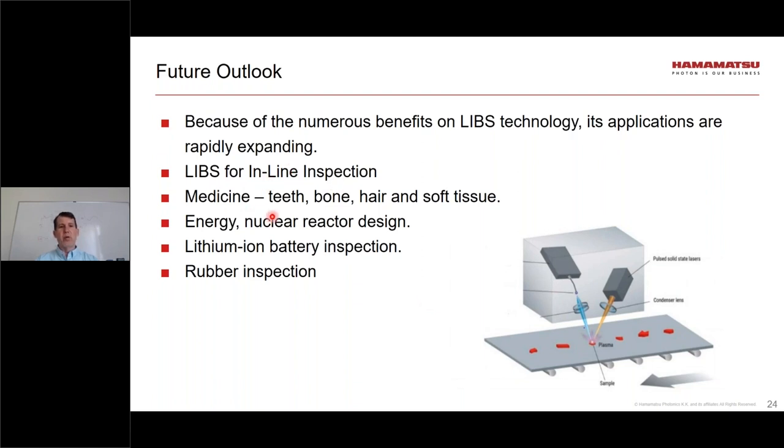You'll also hear about the use of LIBS for detecting fluoride in medicine type applications, in bones and teeth. Energy and nuclear reactor designs use LIBS technology, as well as lithium-ion battery inspection and rubber inspection. These are all additional areas where LIBS technology is being implemented.